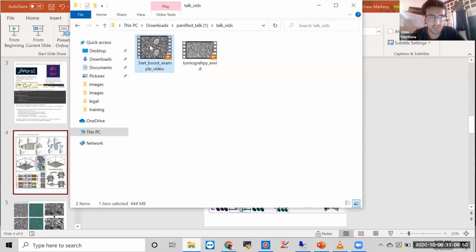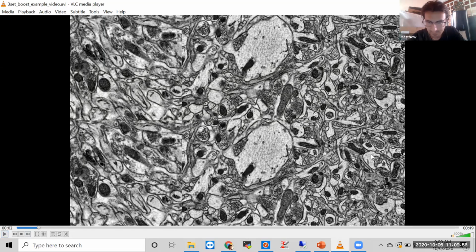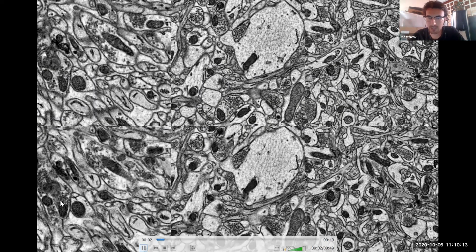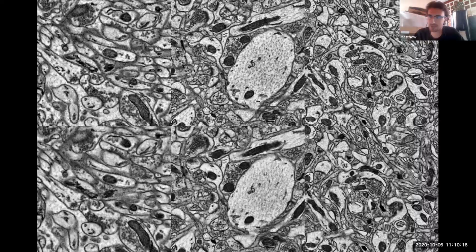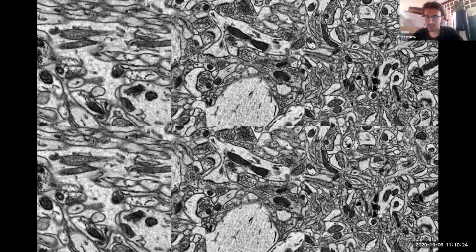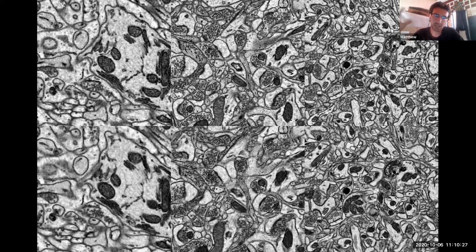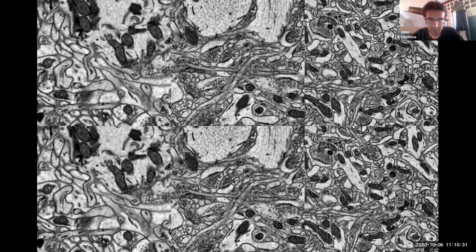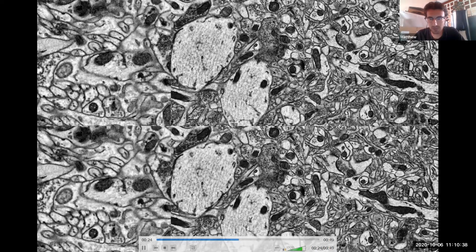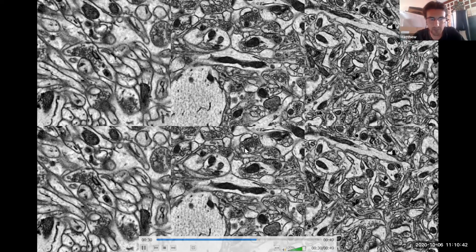I'll show a video of that. So in this video, the bottom row is the original volumes as they were acquired raw from the microscope, and then the top row is their artificially enhanced version, where the z-axis has been given an extra slice in order to help with visualizing the structures and giving you a microscopy output that otherwise would have required a microscope that had to be very delicately engineered and would have been a lot more expensive, and there would have been trade-offs with throughput and quality, and that's a whole other presentation. And so what I hope you appreciate from this video is just the smoothness of this upper row versus the bottom row, which the bottom is the raw and the upper is the generatively interpolated.